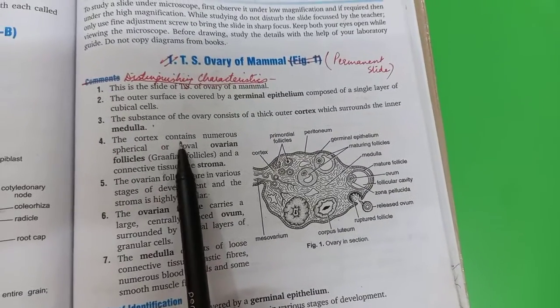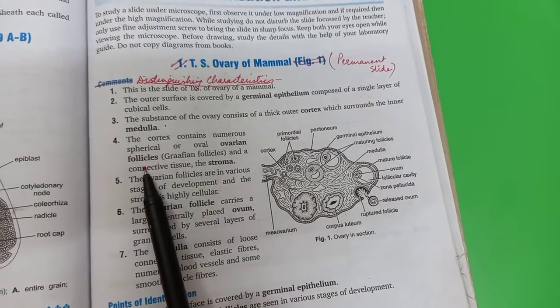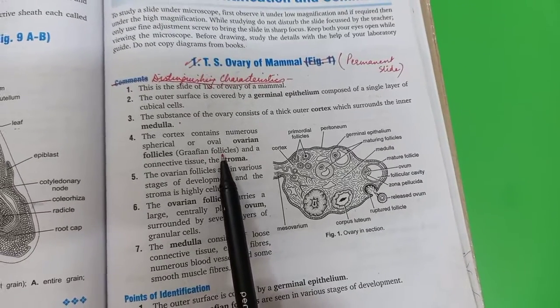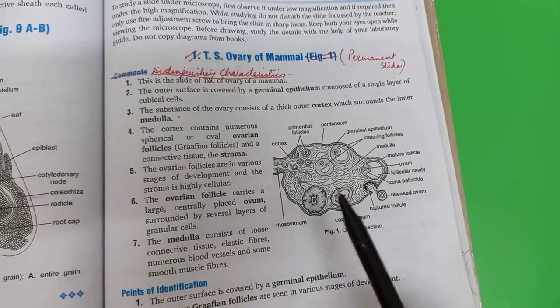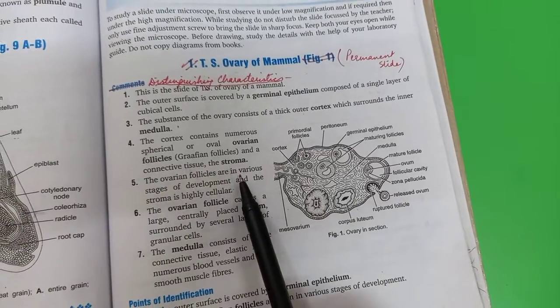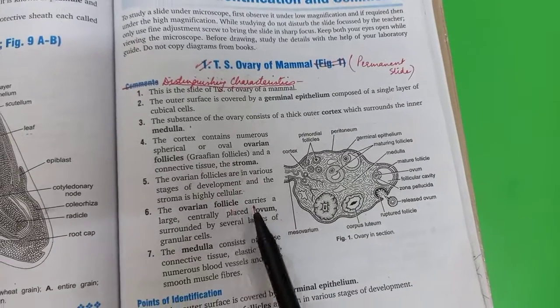Fourth point, the cortex contains numerous spherical or oval ovarian follicles or Graafian follicles. Graafian follicle is the term used for the ripe follicle which is ready to release the ovum, right? And a connective tissue, the stroma. Then, ovarian follicles are in various stages of development and the stroma is highly cellular.